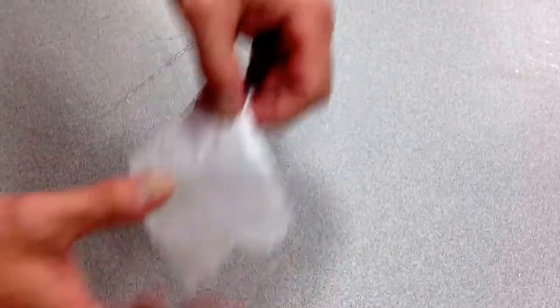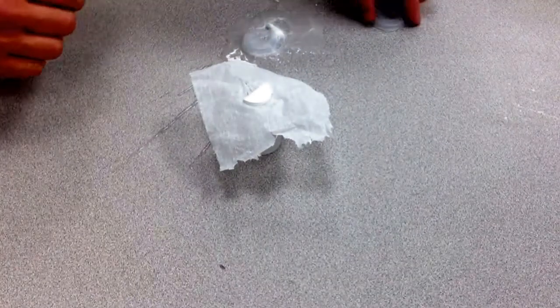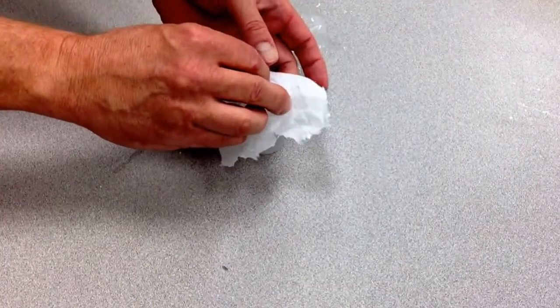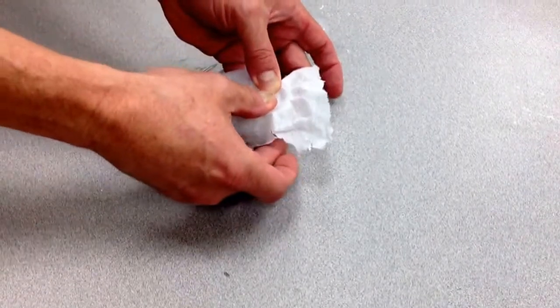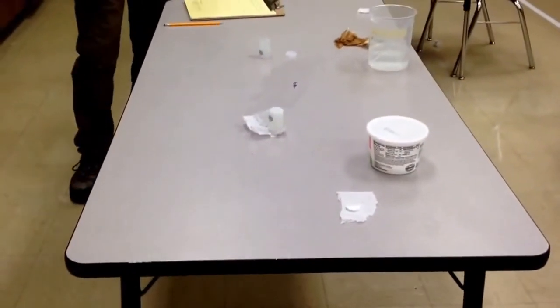And we'll do the same exact process now. The only thing I'm changing, and you want to talk about that in your procedure, is the amount of water. That's what I'm changing. All right, we're going to seal that up. I'll start the reaction. Go. And I'm stepping back again.